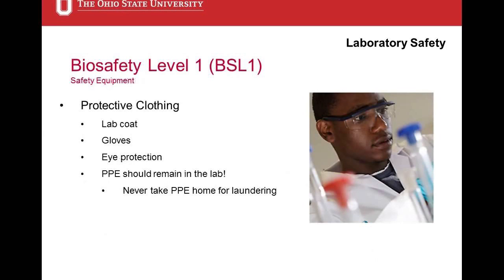Protective clothing at BSL-1 is your basic lab PPE. You should be wearing a lab coat, gloves, eye protection, especially if you're working with chemicals. And the cardinal rule of PPE is your PPE remains in the lab. You never take your PPE home for laundering.